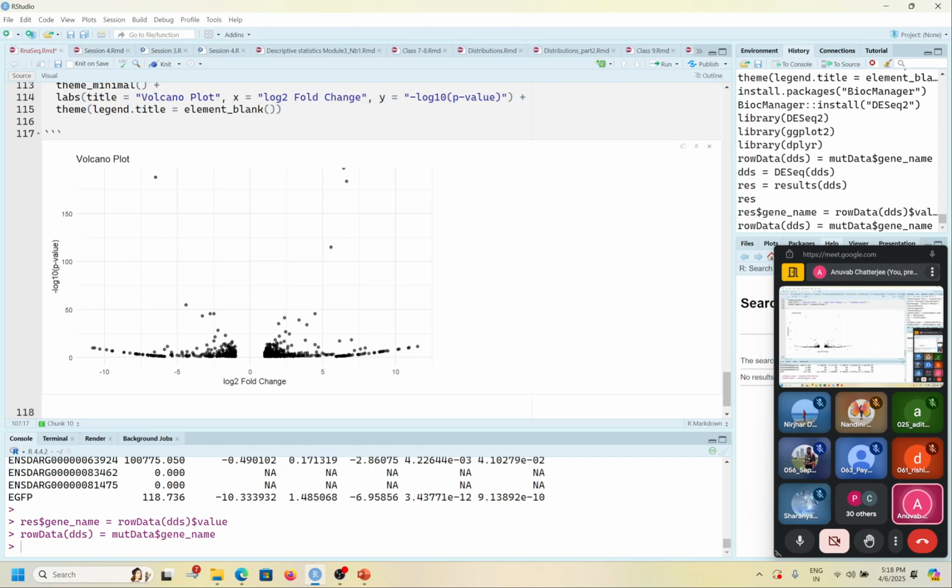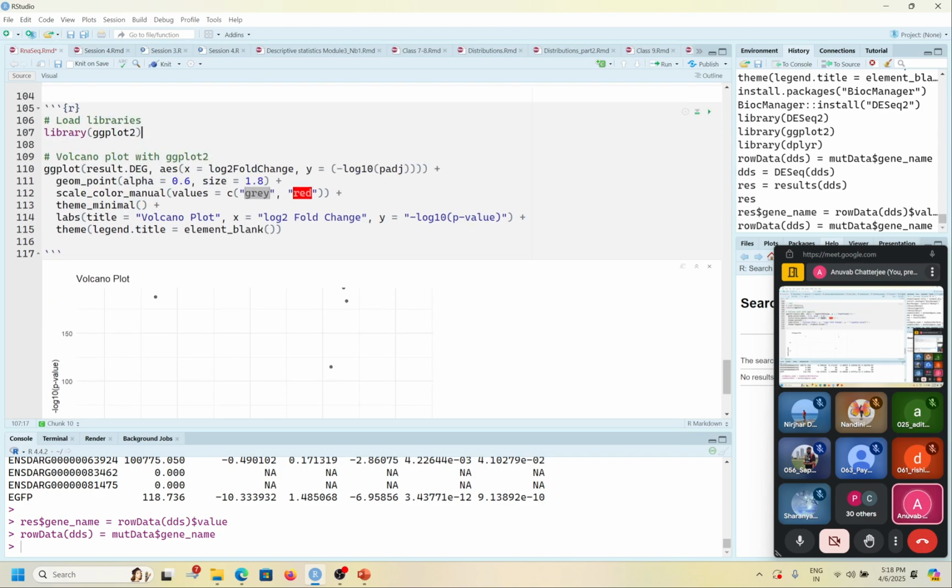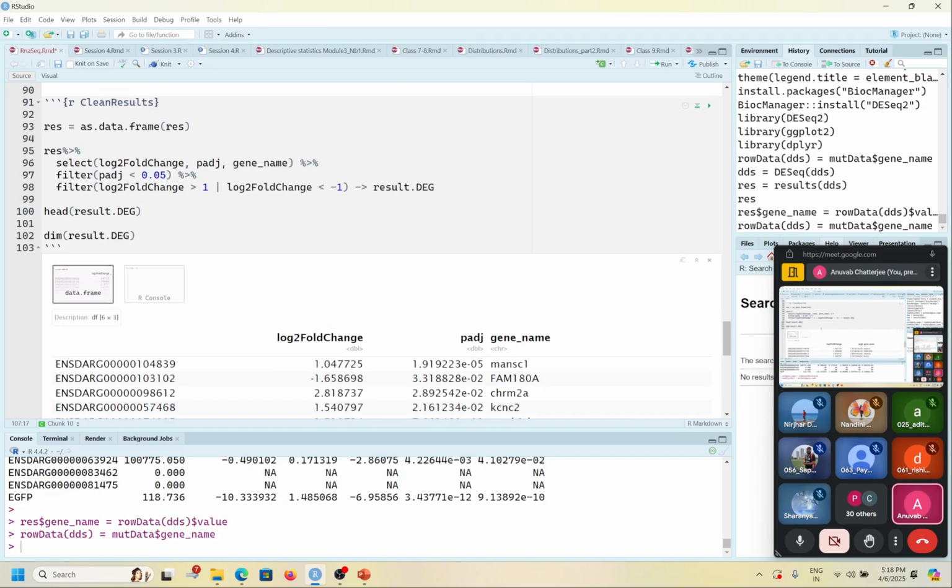The ones over here, you will see a lot of genes here. These you are not very interested in. The fold change is very less, significance value is also very less. So this was what I was saying, that most of the genes will be the same between the test and the control, mutant and the wild type data sets. Only some of them will be interesting, and these are the ones which are above here. If you look at more and more data sets, you will see volcano plots most of the time look like these huge thingies with all the stuff here. I can show it to you.